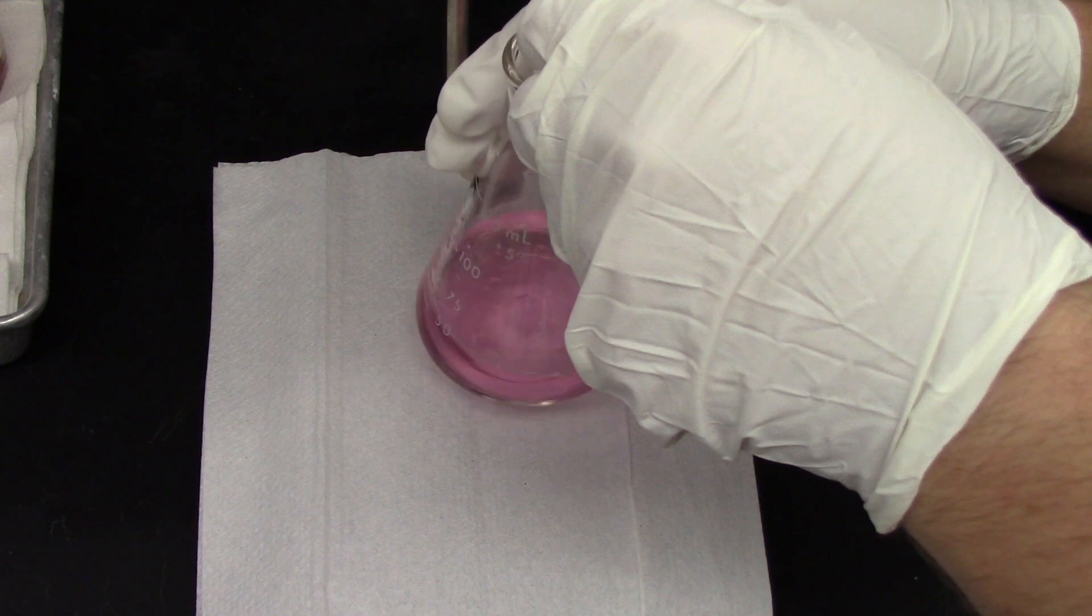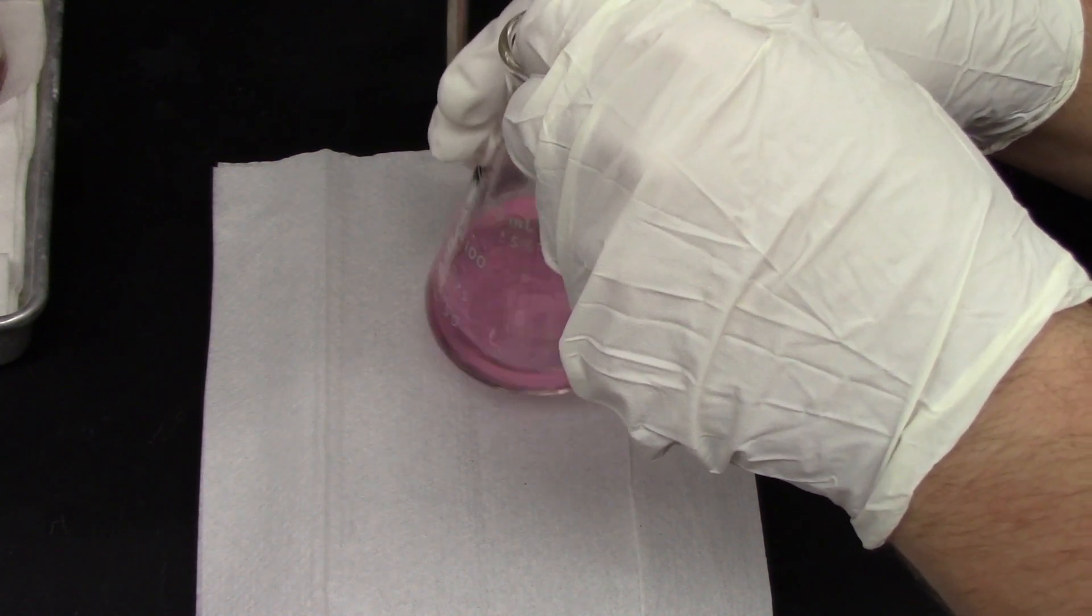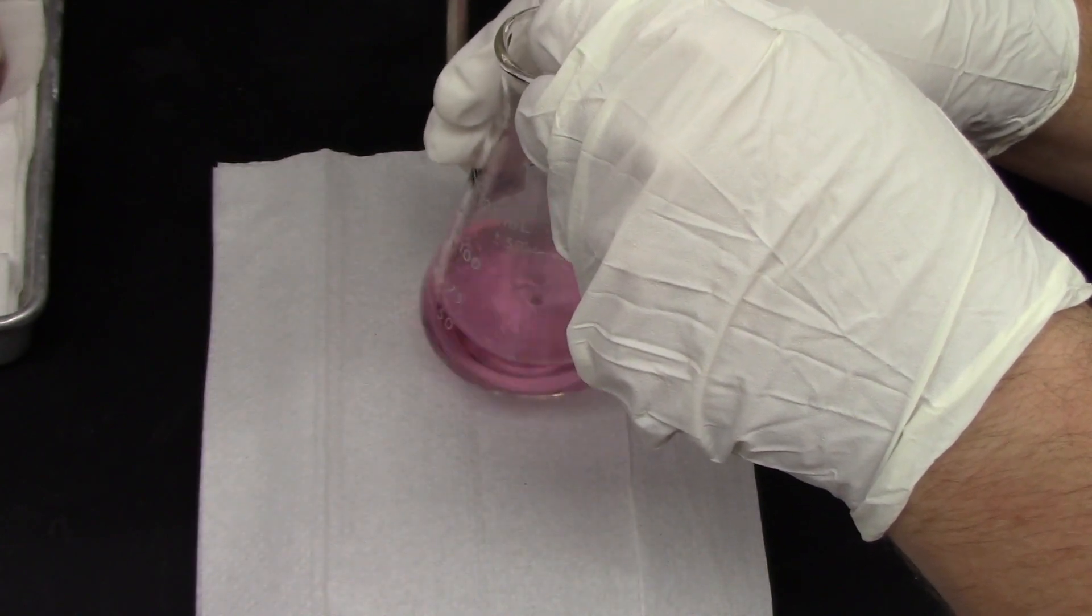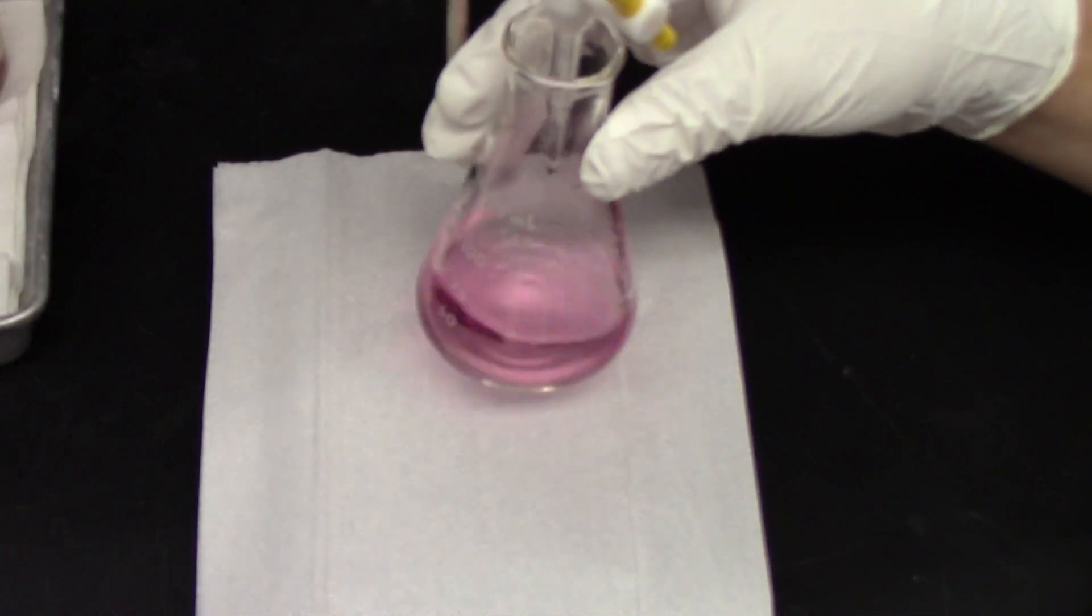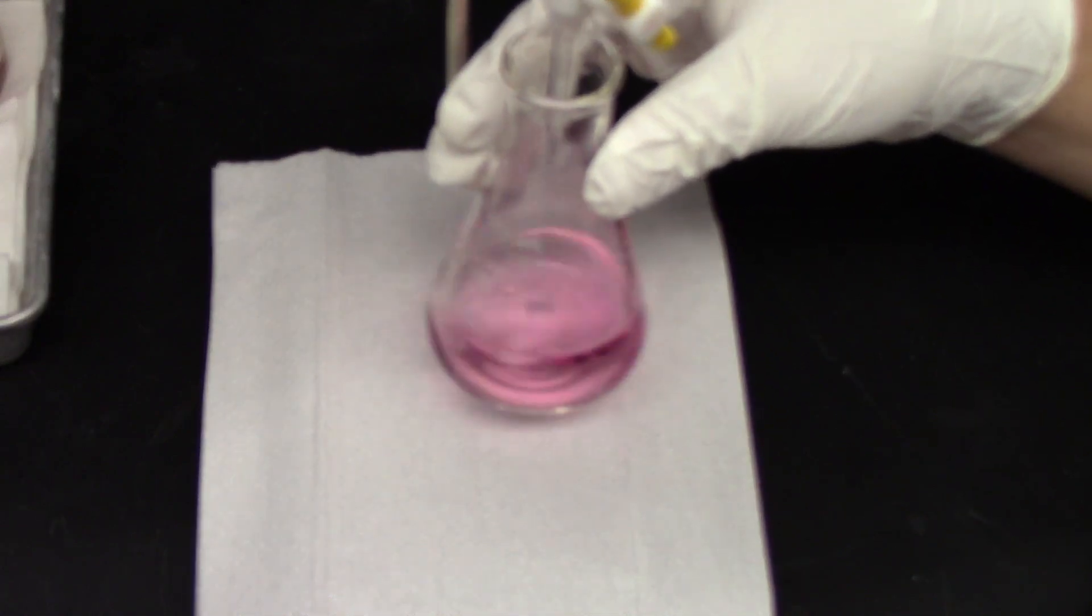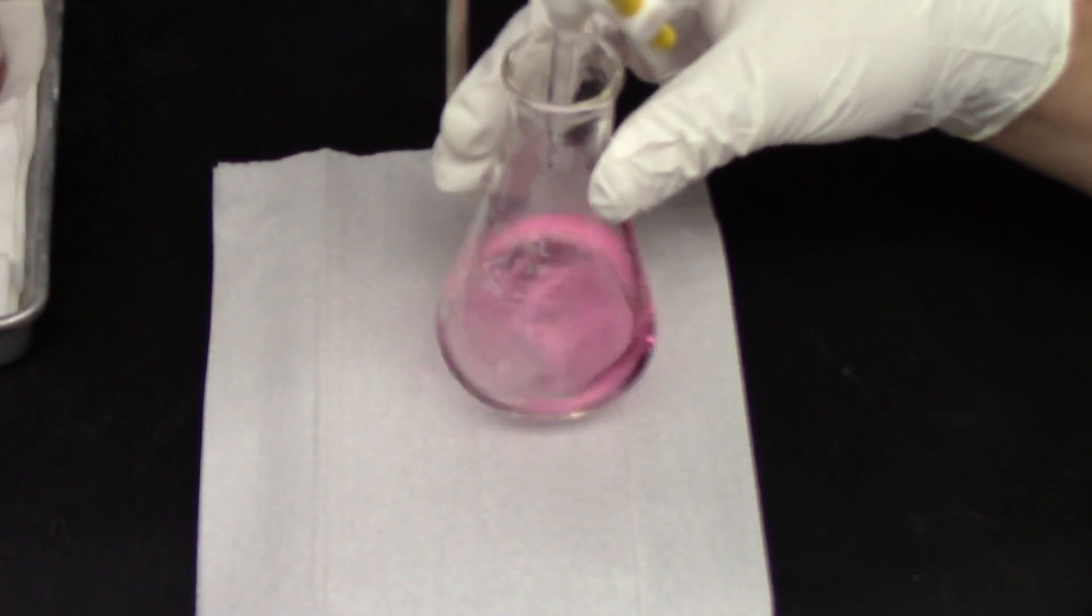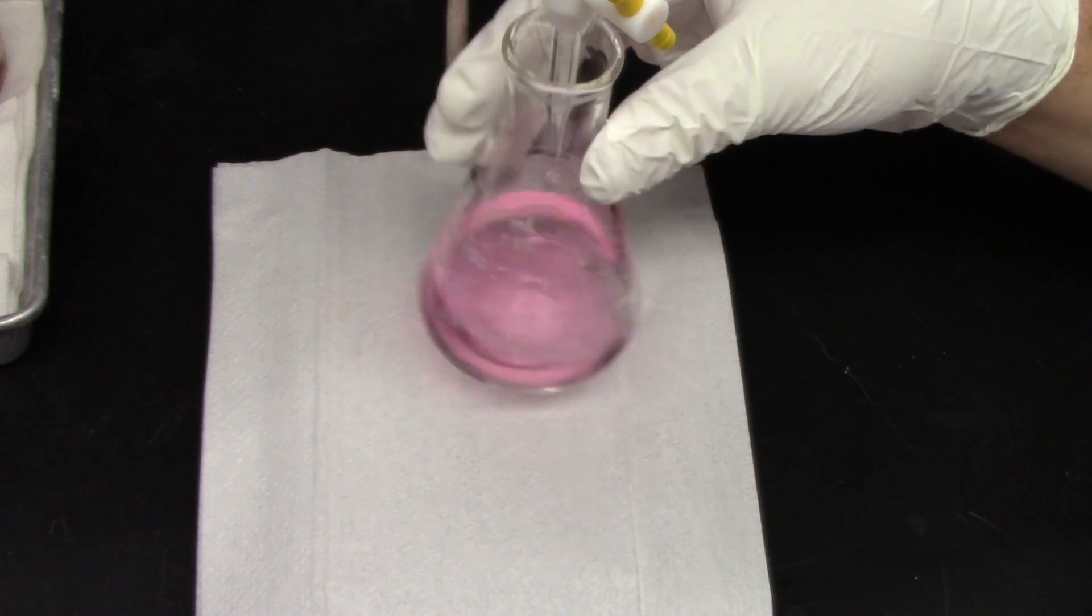You don't want it to go too fast because you want to be able to catch the equivalence point or the end point. The end point is where the solution changes color. So here we go. We're just dropping the base now. So the base is just dropping in, drop by drop. This might take a little while, so be patient. Continue swirling the flask. Make sure you get good homogeneous mixing, and be prepared to turn off the stopcock as soon as the solution turns to a yellow color.